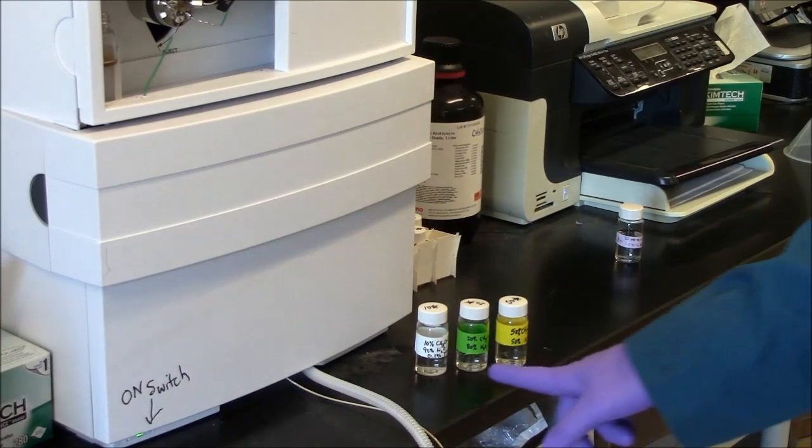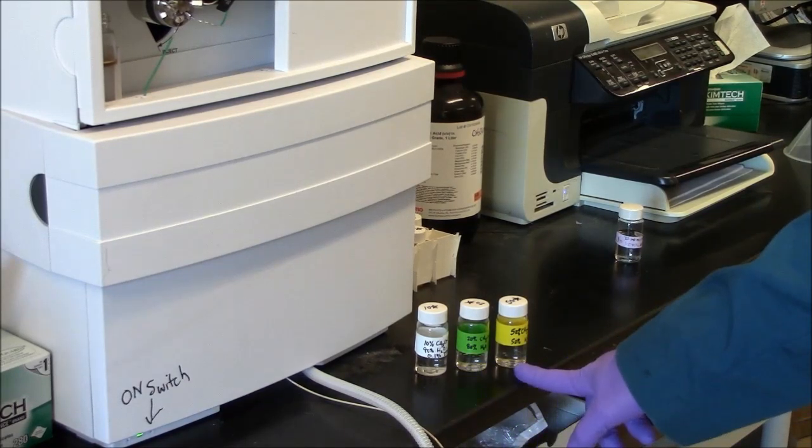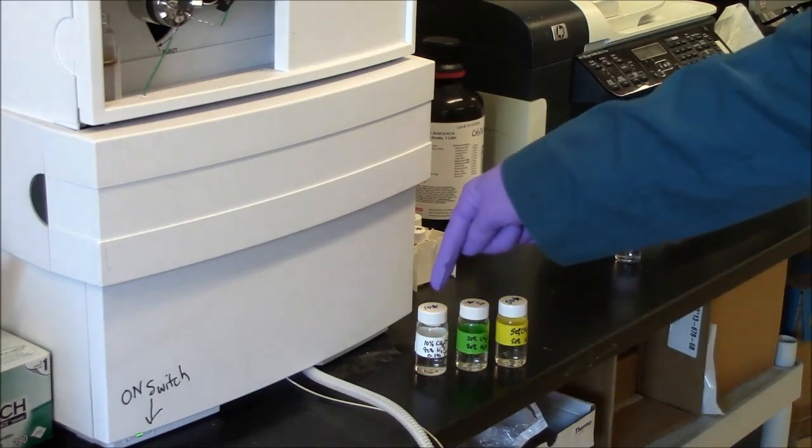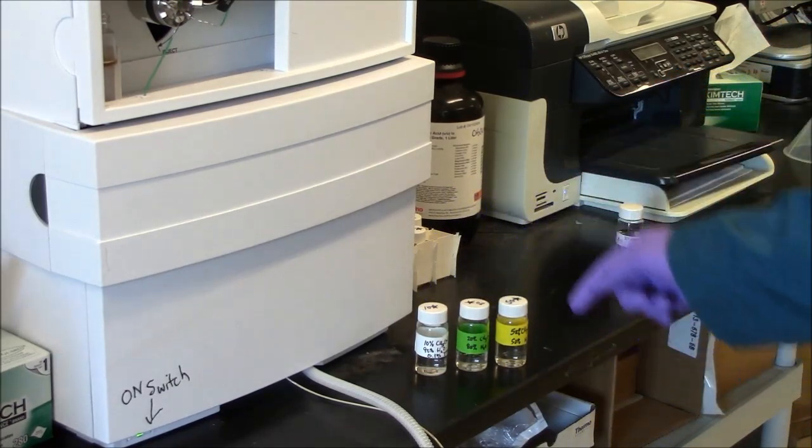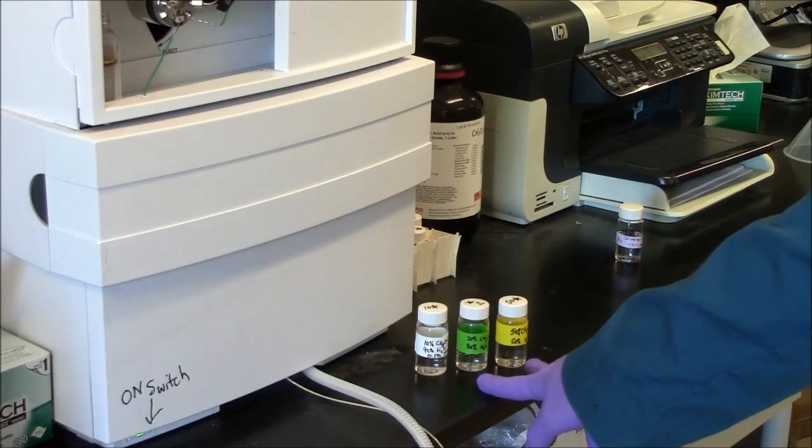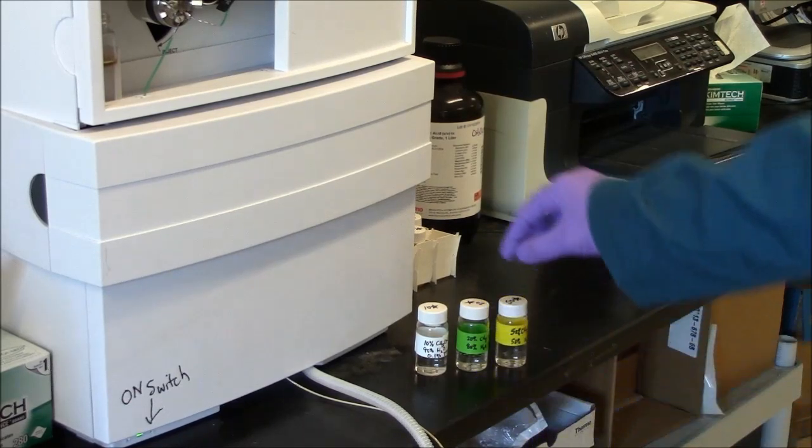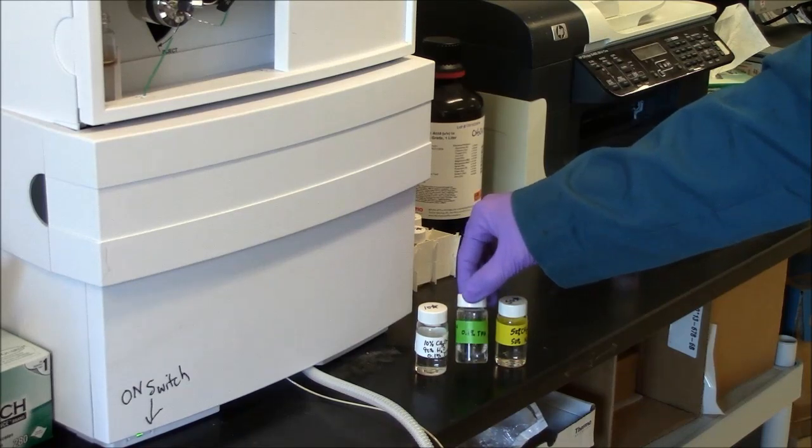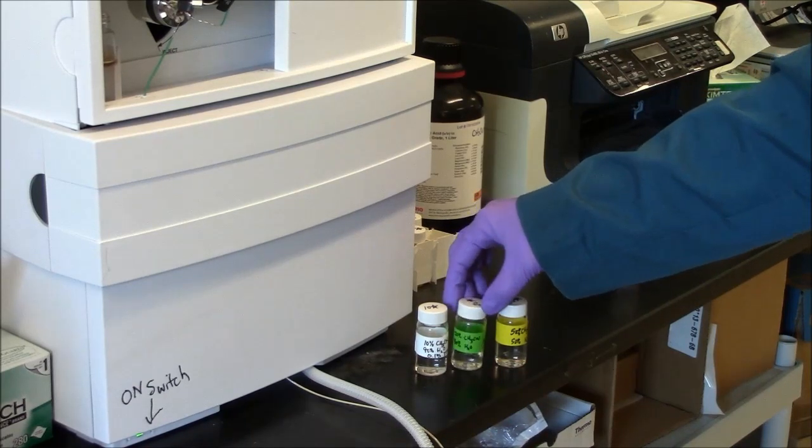For the HPLC, you use different solvents to dilute your sample. I've labeled these as 10-star, 20-star, 50-star. The number indicates the percent acetonitrile in these mixtures. The star indicates they also have trifluoroacetic acid. It's an acidulant. It's 0.1 percent.